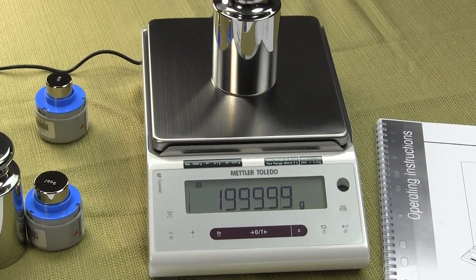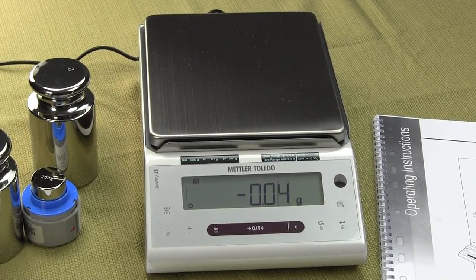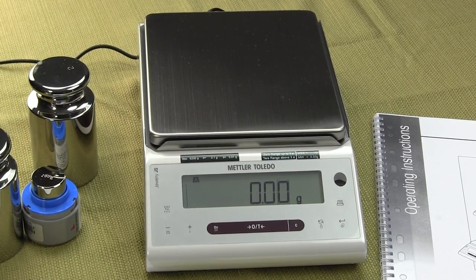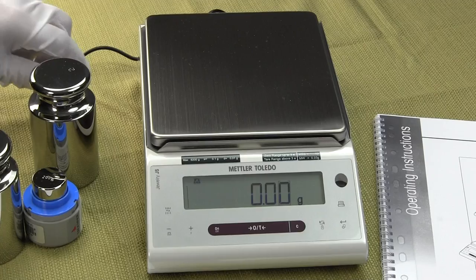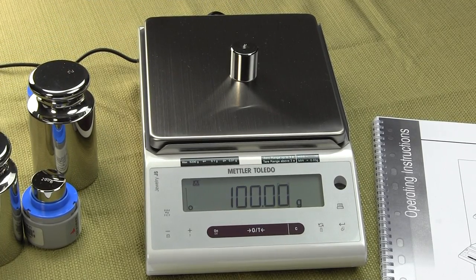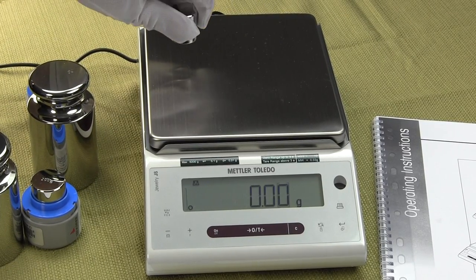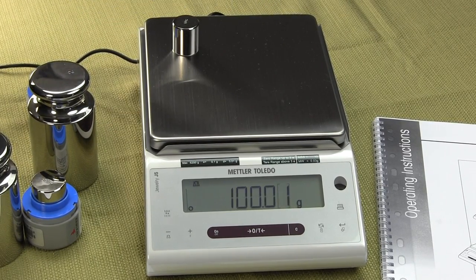So that's 2000 grams. Some of the features with the JS series here from Mettler Toledo, this is the new classic series. You can see the balance performs very quick. These are all class 1 weights.